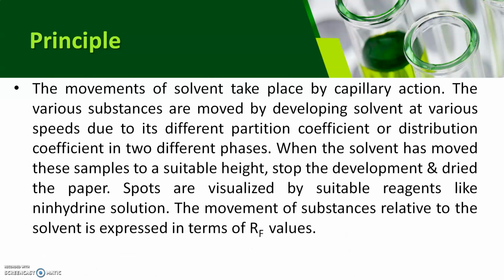The movement of the solvent takes place by capillary action, and the various substances are moved by the developing solvent at various speeds due to their different partition coefficient or distribution coefficient in the two phases, that is stationary phase and mobile phase. When the solvent has moved the sample to a suitable height, stop the development and dry the paper, and the spots are visualized by a suitable reagent like ninhydrin solution. The movement of the substance relative to the solvent is expressed in terms of the RF value.